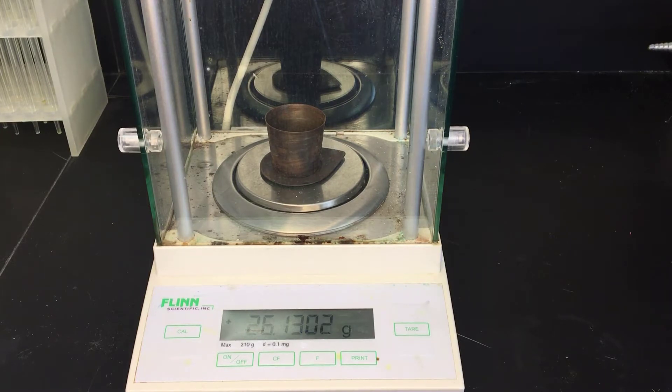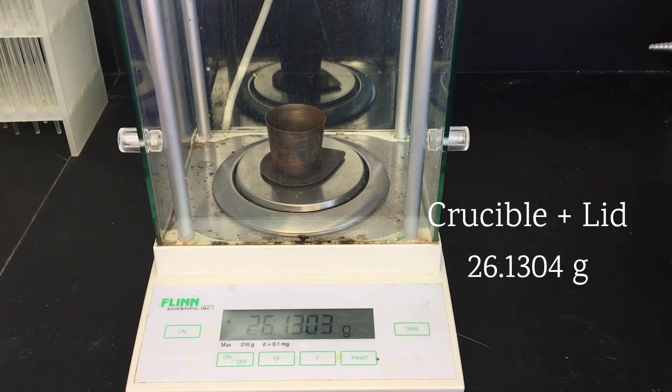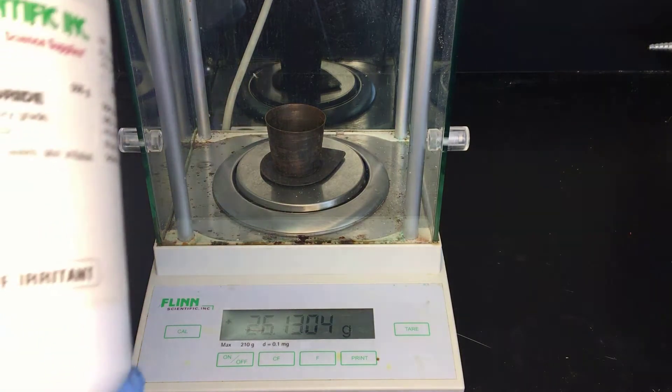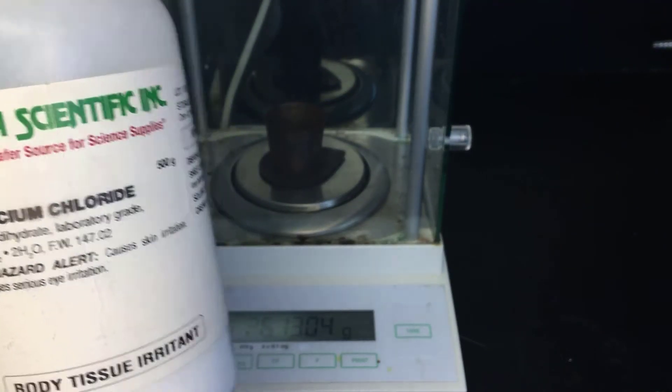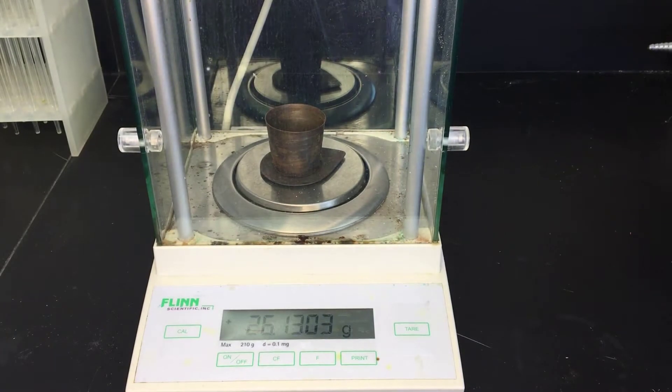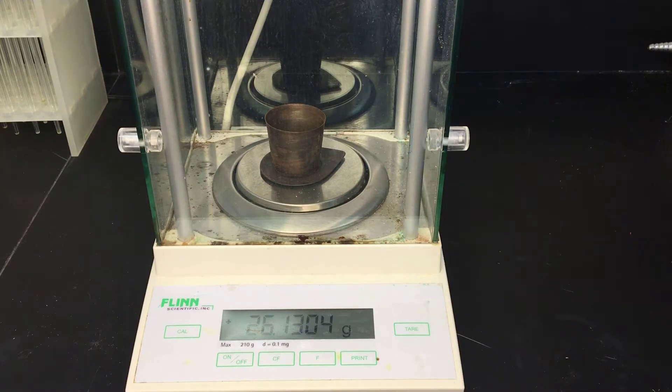Rather than using weighing paper or a weighing tray, where some of the material could get stuck to it, we're going to use the crucible as our container. We're going to add between one and a half and five grams of salt. I'm going to aim for about three grams each time. Occasionally, I'll exceed that. And ideally, we would do three trials with each.